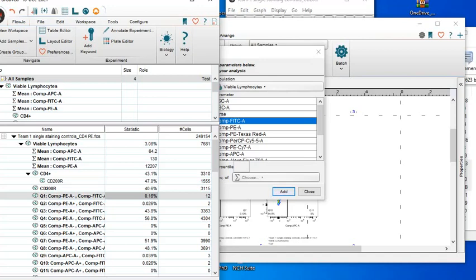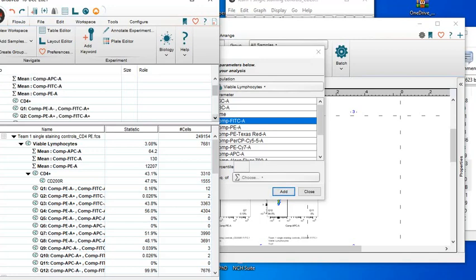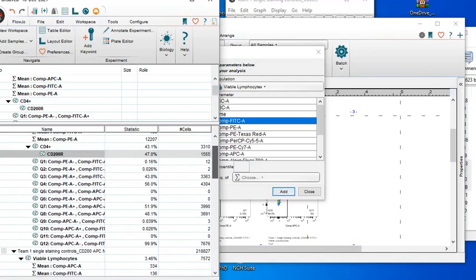So my apologies, we'll go back. There's something we missed. Actually, in gating, you gate it in the CD4 cells. So it runs through all of them now.